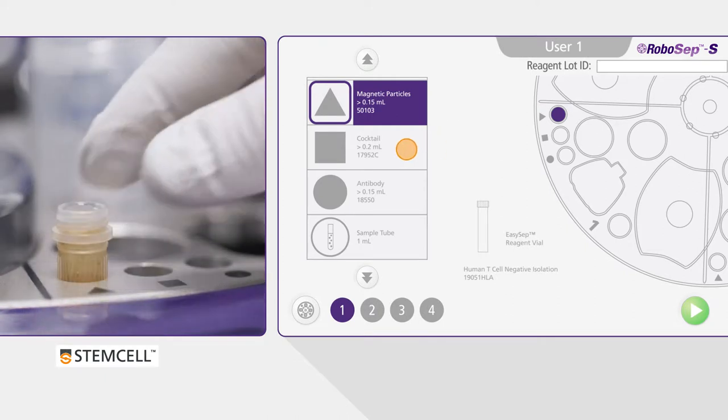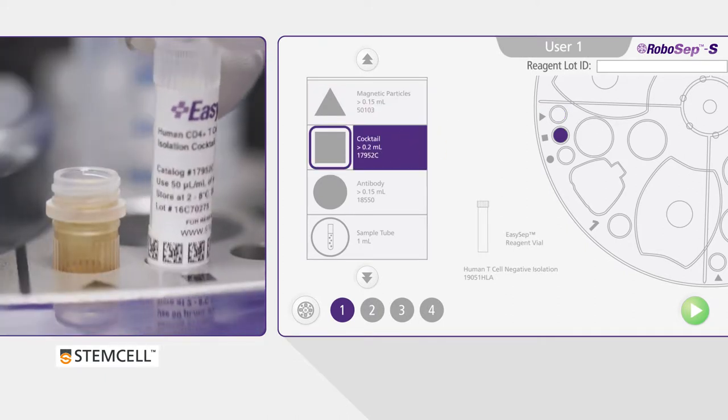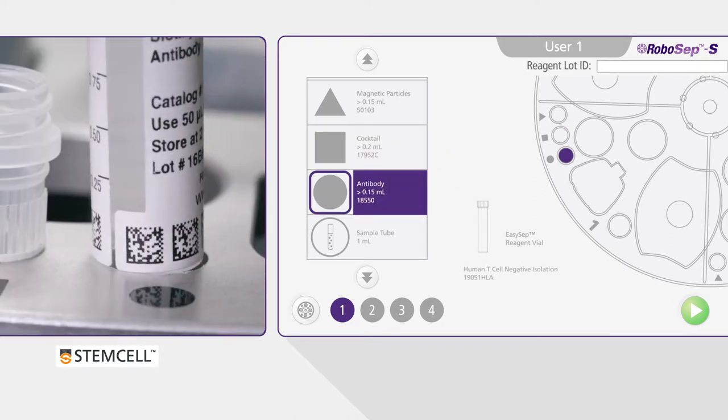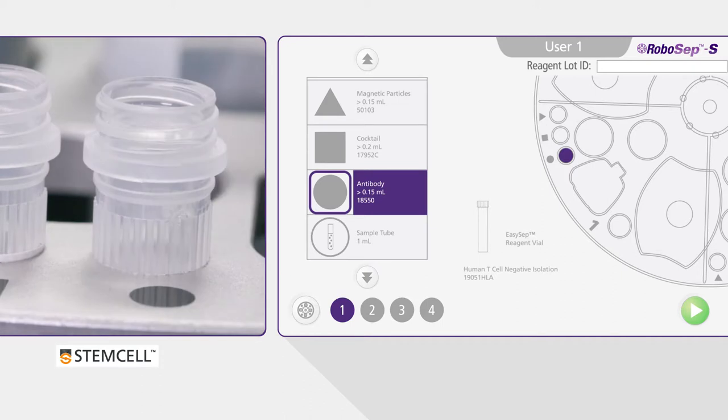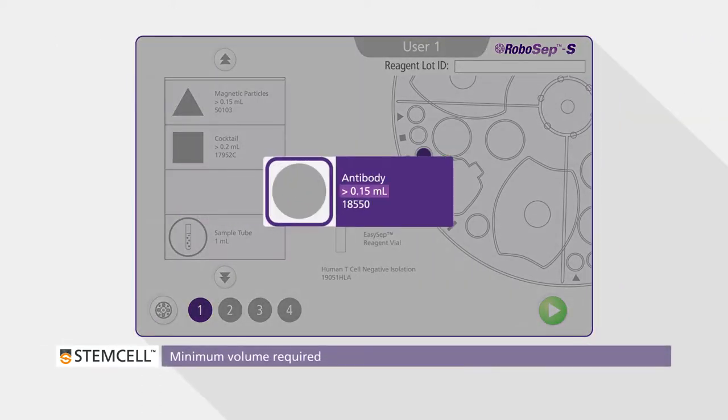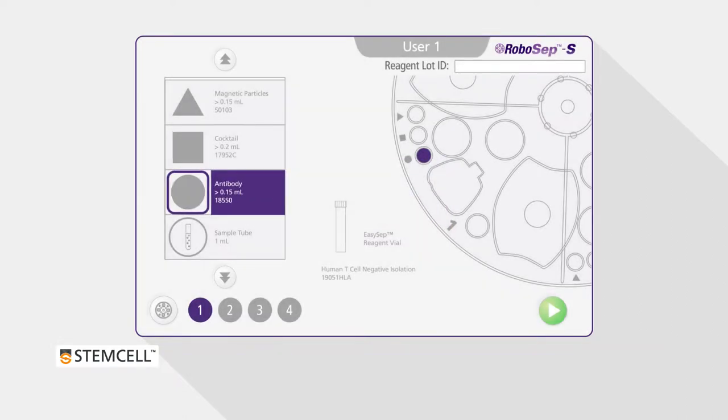Load the reagent vials one at a time, following the on-screen prompts. You will see the corresponding part number for each of the reagents that need to be loaded. Make sure that each vial contains the minimum reagent volume required for a given cell separation. This will be displayed below the name for each reagent.